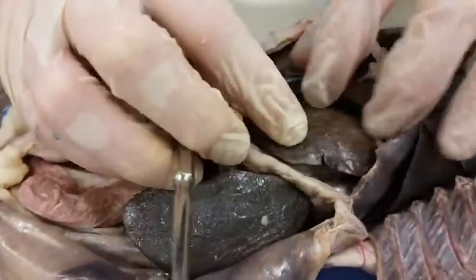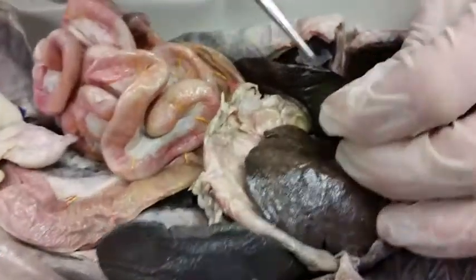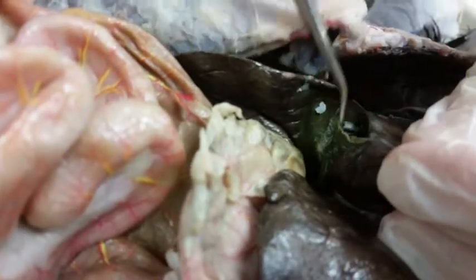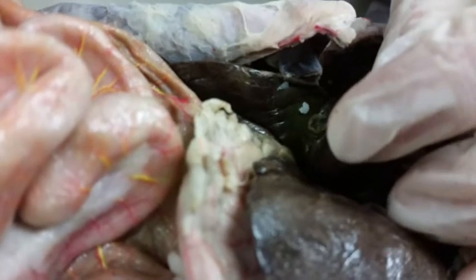Okay, so as for our liver, you can see the gallbladder right here. It's stained the surrounding area green, but we've got gallbladder right here. Let's find the caudate lobe here.